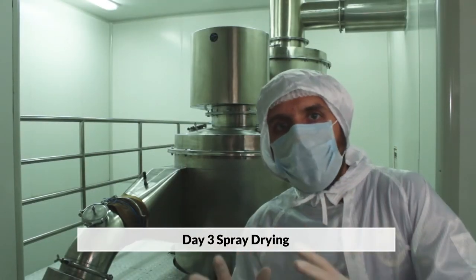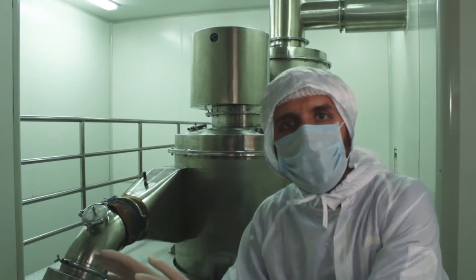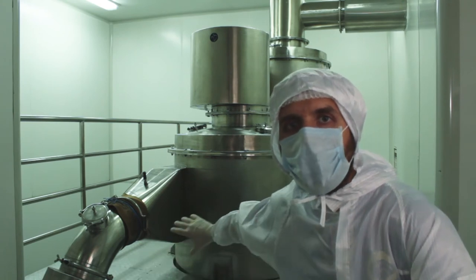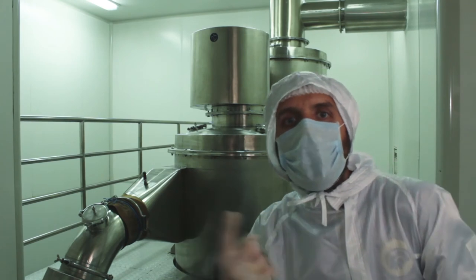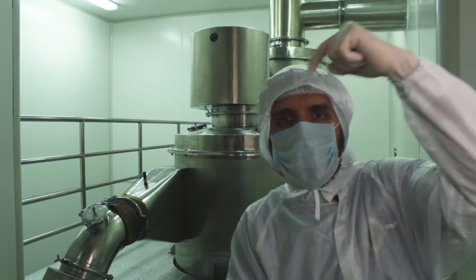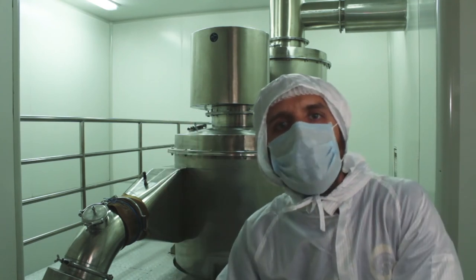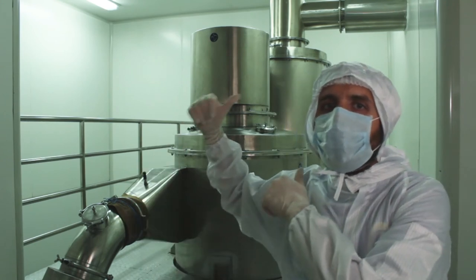This is the top of the spray drying system, just behind me. Our solution from the tank, which is stirring it at about 85 to 90 degrees, comes through that pipe behind it and goes into the big column, where the wind circulates at about 170 degrees Celsius. The solution goes in from the top, the wind circulates and dries it off, whipping out the moisture content, and at the bottom we get the powders. All the steam exits from the top behind me.